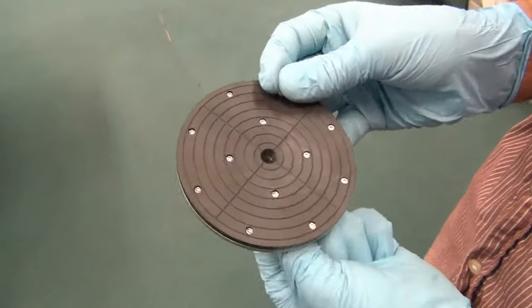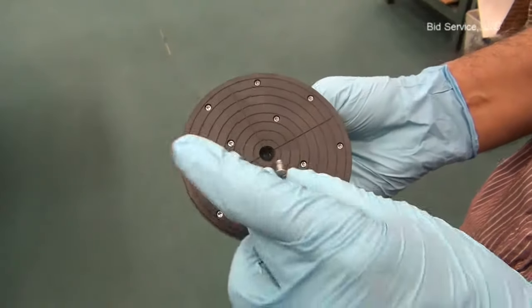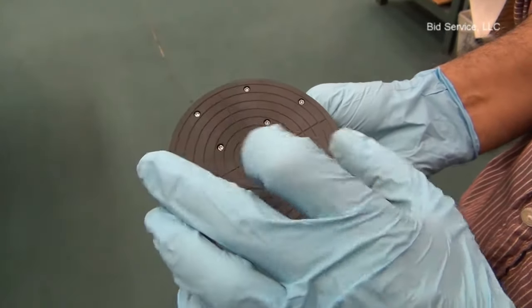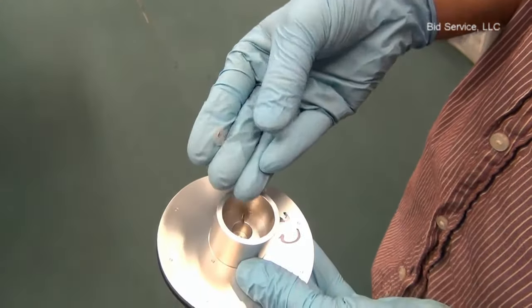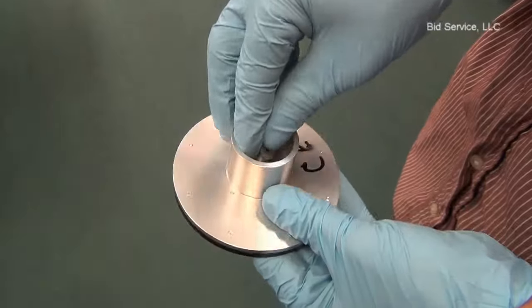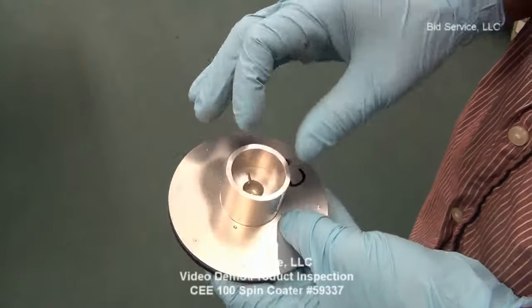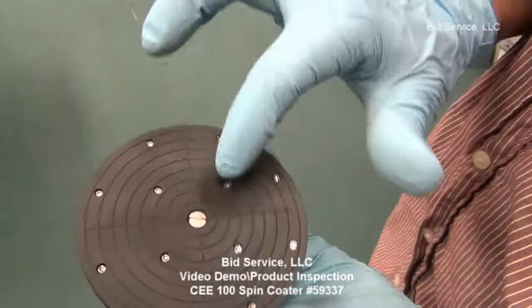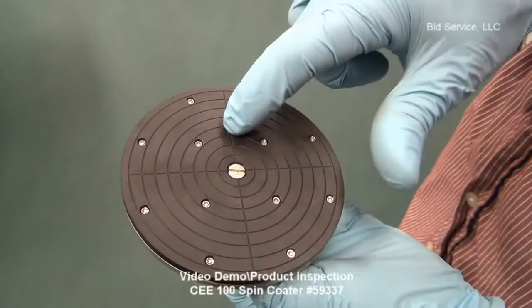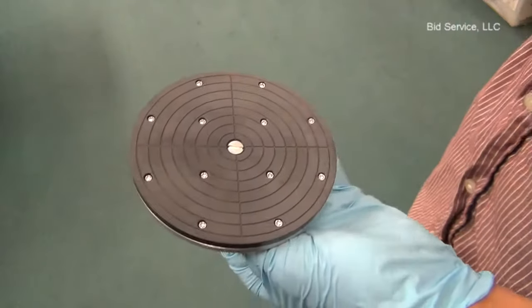This is a 4-inch chuck for the CEE-100. There is a counter-sunk center screw at the center. There is a 1 mm silicone washer that should be inside before the washer — it seals the vacuum better through the screw to the grid pattern on the chuck.